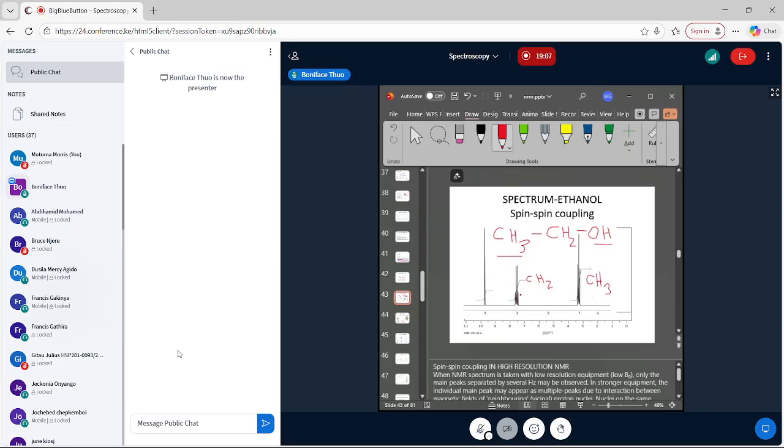So if you look at this peak, okay, the main chemical environment, which is at around 3, due to the methylene, it has been split into 4 subpeaks. 2 in the middle are large, the 2 outside are smaller. But if you look at the heights of the 2 outer ones, they are the same, and the 2 middle ones are the same.